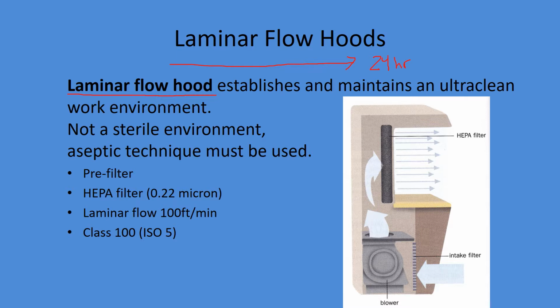So laminar just means parallel currents of air, just like laminated pieces of wood. And that flow is going to help sweep out any contaminants, any particles that might be in the environment. So that clean environment is produced by a HEPA filter, high efficiency particulate air filter.